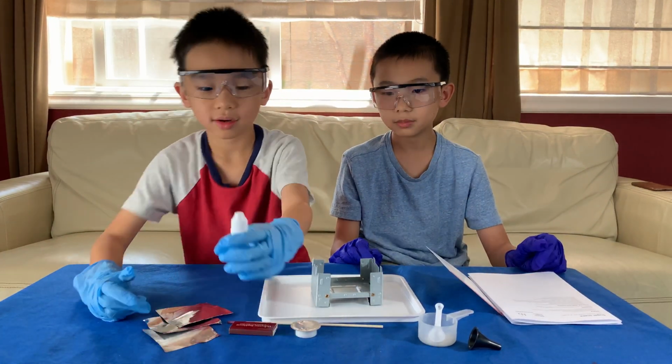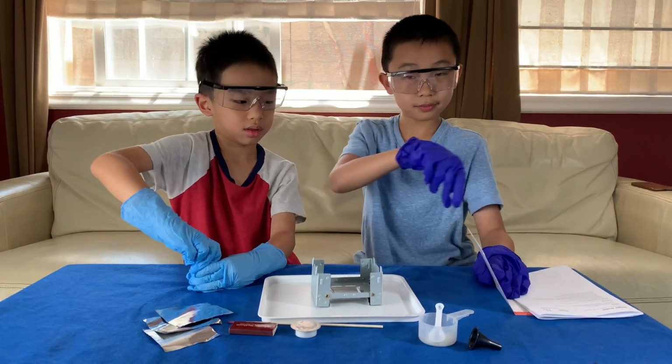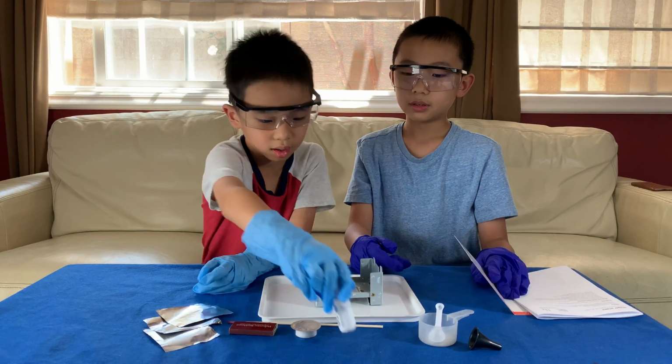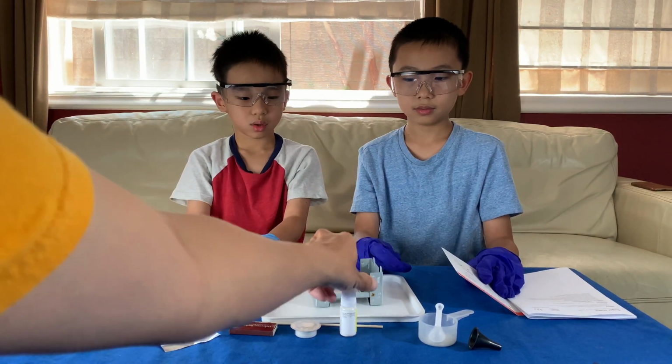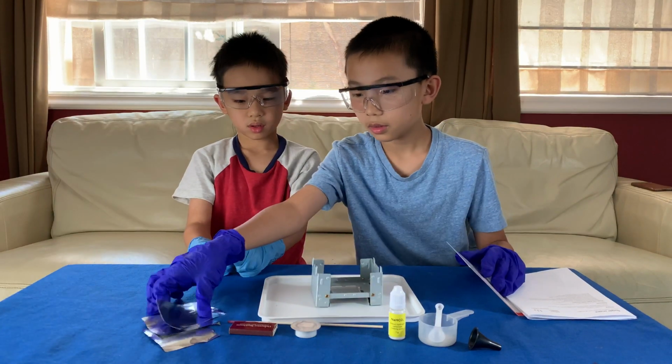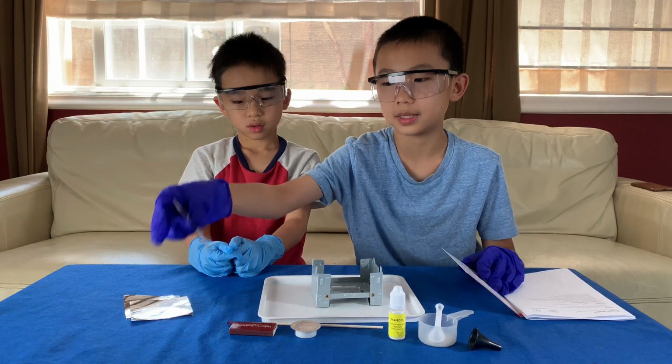Before that, you want to tell us what everything is? Oh yeah. Okay. Alright, let go, pull it back. Hold on, no wait. Ready? Turn so that we see this. Okay. Make sure they're all one piece of foil because these are thick.